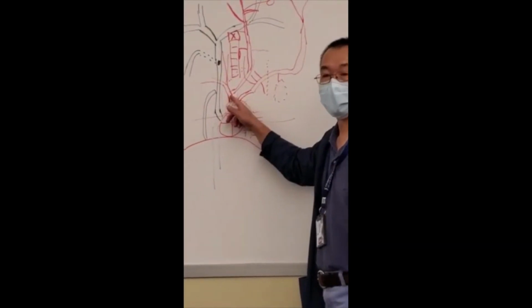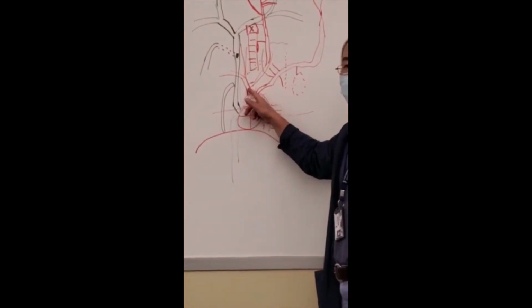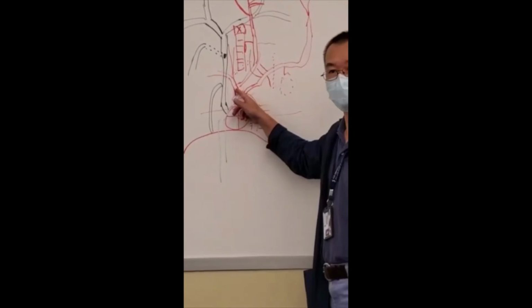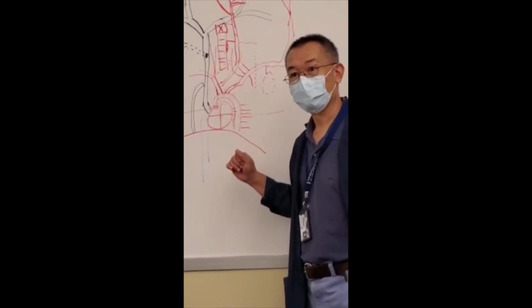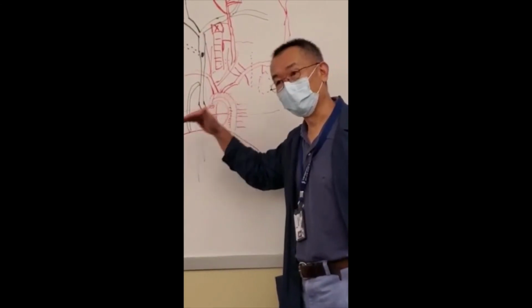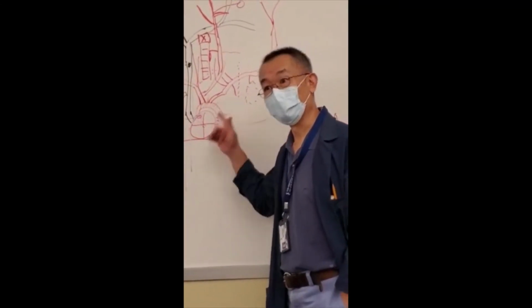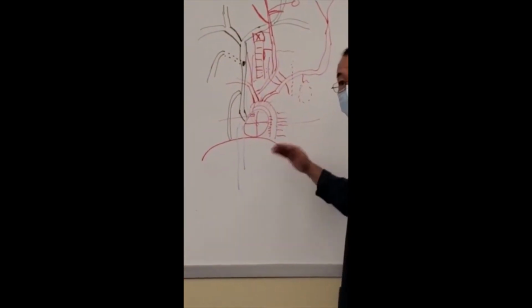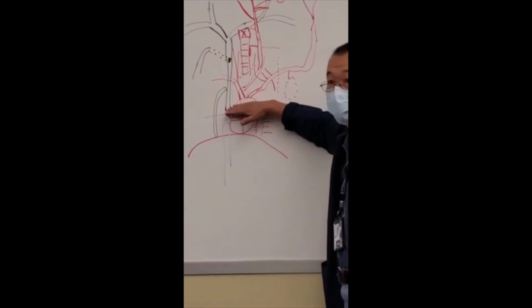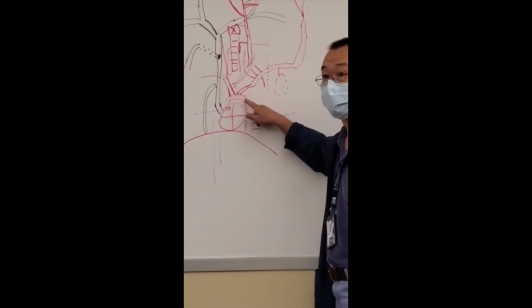I heard from my former student that this question was asked in the HESI test, because they want to confuse you. You need to know the aortic arch and the aorta. The aorta is the whole thing, right? The aortic arch is just this piece. This is the arch.